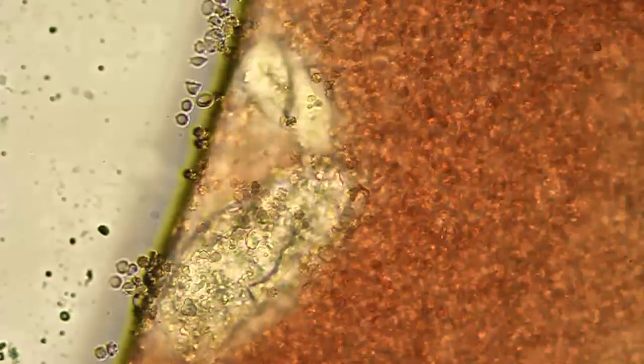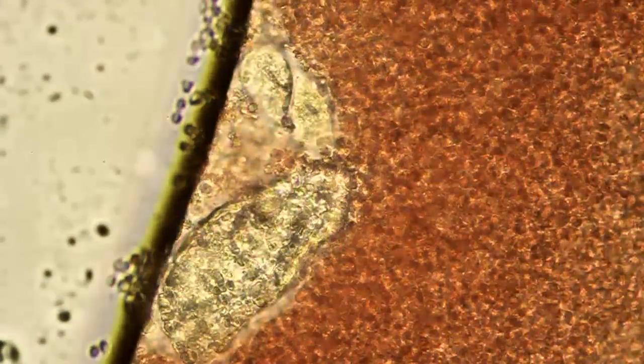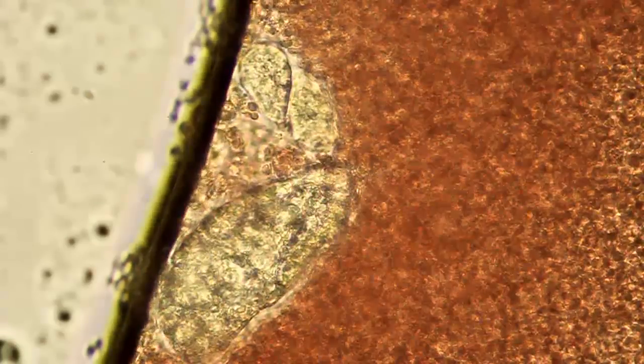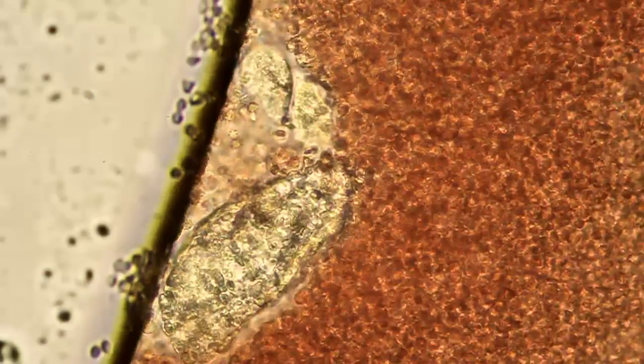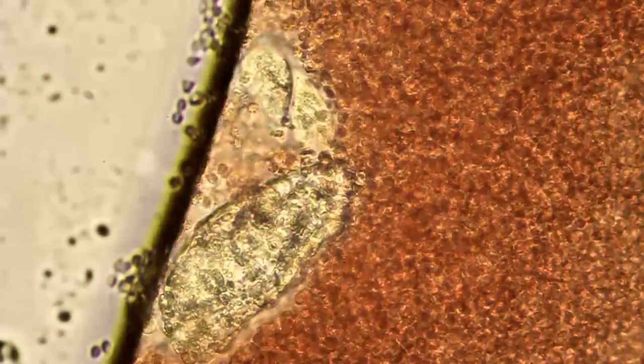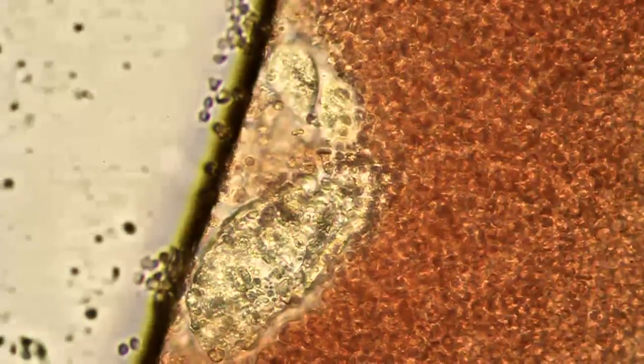I was flipping out a filter in the microscope to give it more light. See, I don't know what these bigger objects are, but I think they came with the blood.